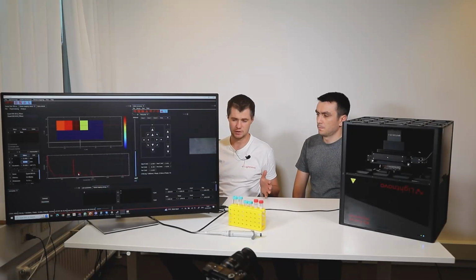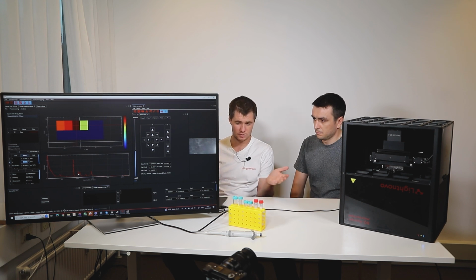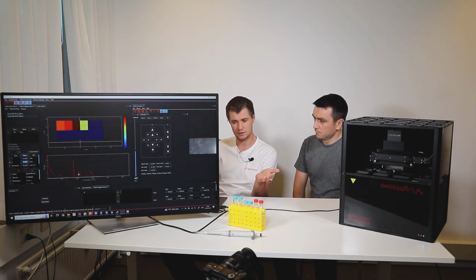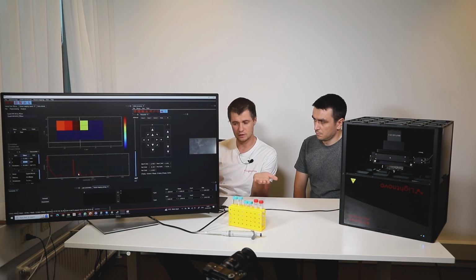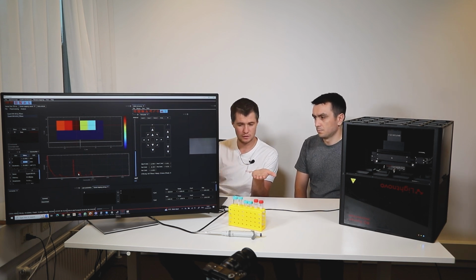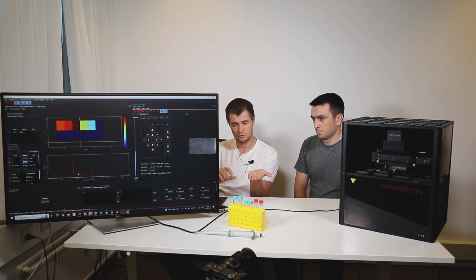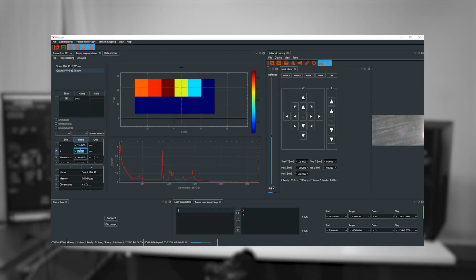Since we're waiting for the measurements, I also could notice that we measure in a standard multi-well plate made of polystyrene. However, since it's a confocal system, we just focus inside the liquid, and the presence of polystyrene is almost absent. Of course, when you collect for a long time at high laser powers, it will still be present. But of course, we keep the same distance between the well and the sample, so we can subtract it afterwards, if necessary. However, in these spectra, you may not even notice the presence of polystyrene.